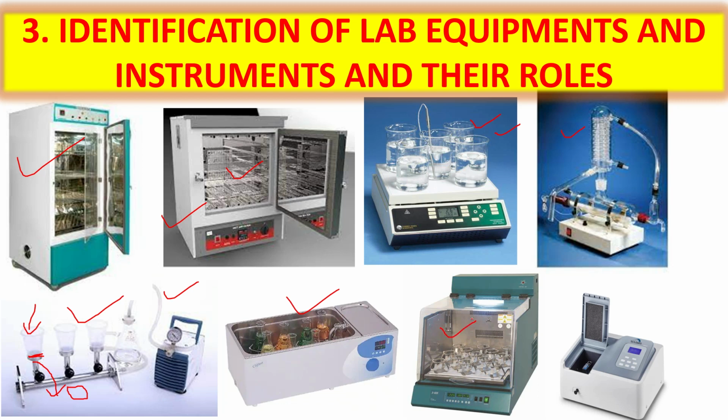Shaker incubator is used when a microorganism requires, for its growth, a particular temperature with continuous shaking. So for that we use shaker incubator. Next thing is a spectrophotometer. So with a spectrophotometer we can see the OD value of any solution.